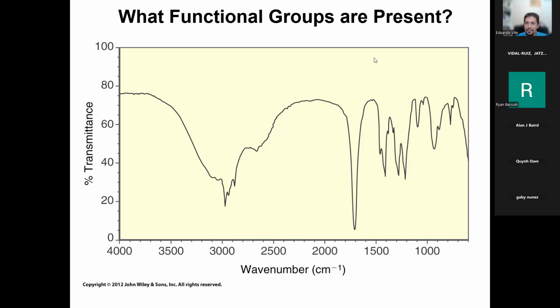Okay, in the chat: carboxylic acid. All right. So there is a carboxylic acid here. So now give me your evidence. Why is it a carboxylic acid? Where are the peaks? Give me wave numbers. Give me descriptions. Very broad peak from 3,500 to 3,000-ish. Okay, sure. Very broad peak. What does that one correspond to?